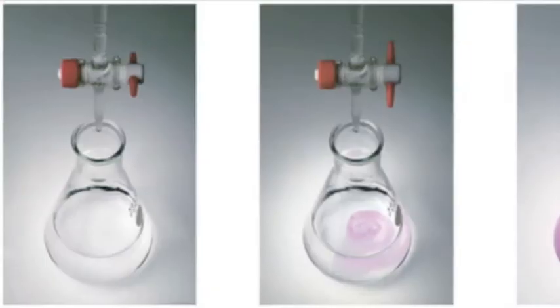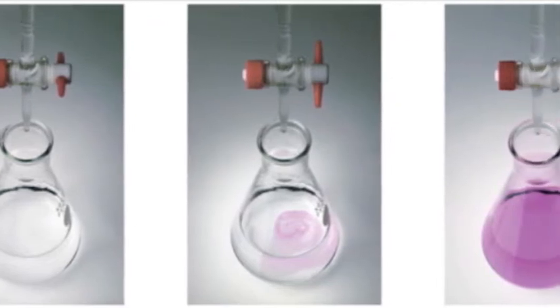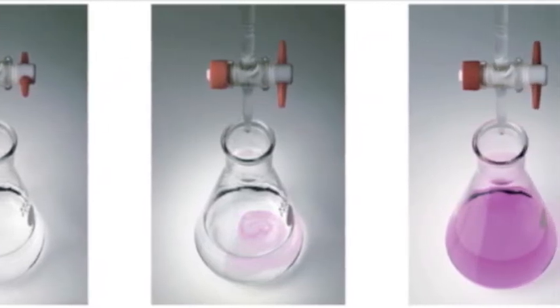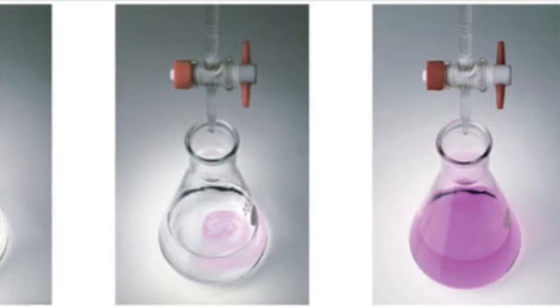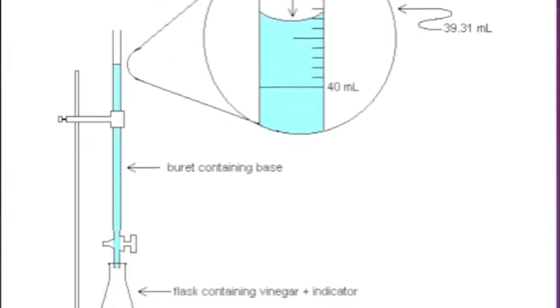Neutralizing was the main reaction in the acid-base titration. During neutralization, the acid and base react to form a salt and water. All the reactants appeared to be clear and would remain that way if an appropriate indicator was not added. Adding an appropriate indicator would result in the color change at the endpoint.